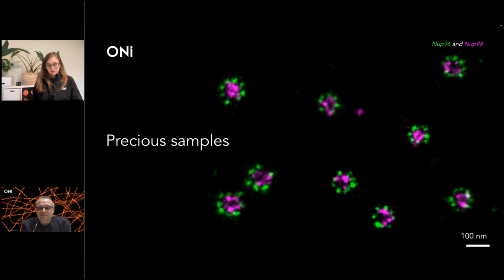And I have a question regarding 2D and 3D models of cells. The question goes, will my results differ in 2D or 3D cell models? Can you comment on that? So the answer in a nutshell is yes. The reason is that in 2D models, we don't have all this extracellular matrix.